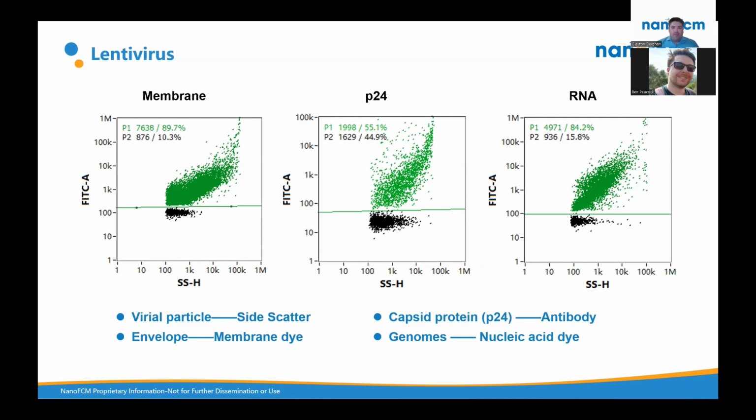And sure enough, when you look at this type of sample, you find, okay, at least 90% of these particles are membranous. And that's maybe trivial and still might not give you enough information to determine, okay, if I have vesicles, does looking at the membrane tell me that something's a virus? Actually, it really doesn't. Those are going to look very similar.